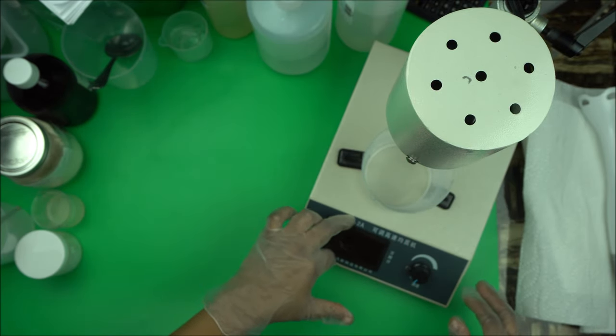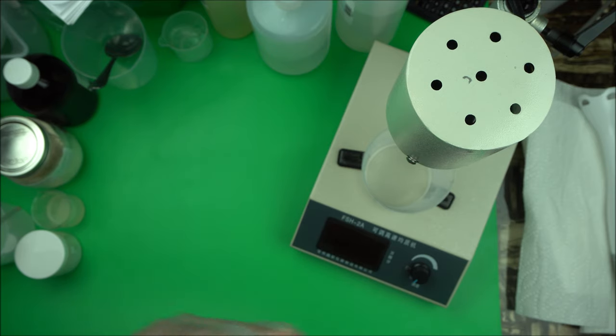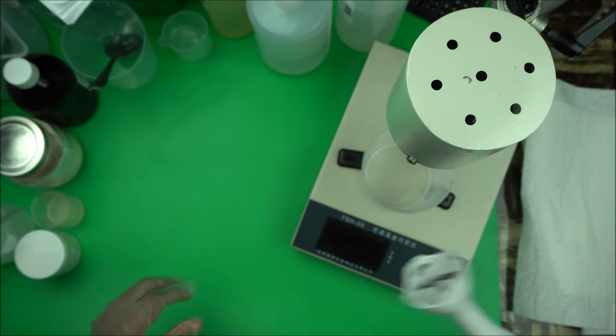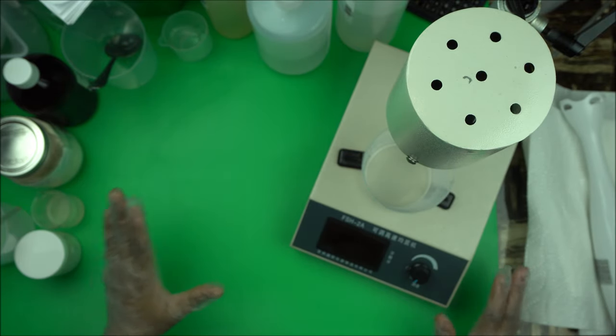For now, I will recommend FSH2A homogenizer for all indie brands, or if you are just getting started, you want to learn more. You need a homogenizer to use instead of your hand blender. Please get yourself a homogenizer, and you'll be glad you did.